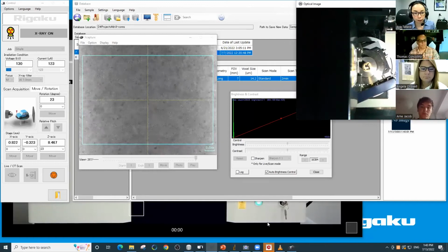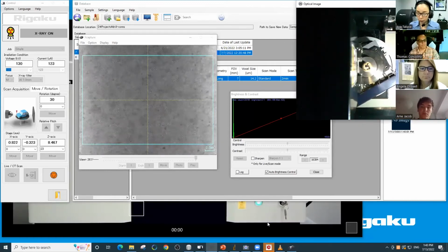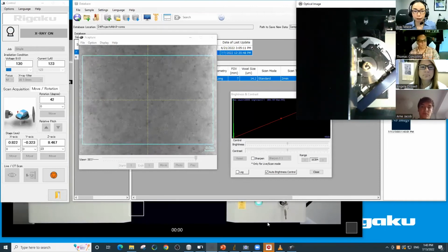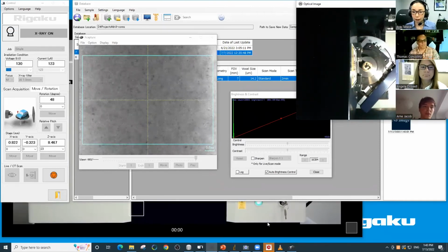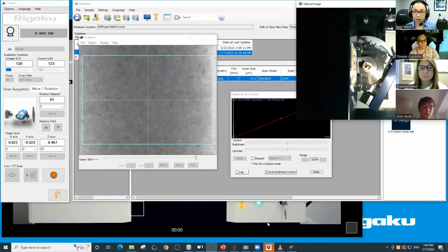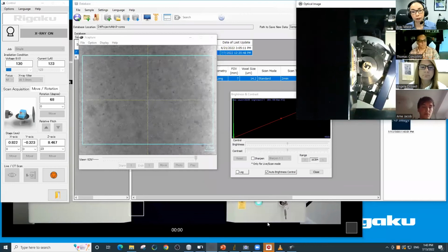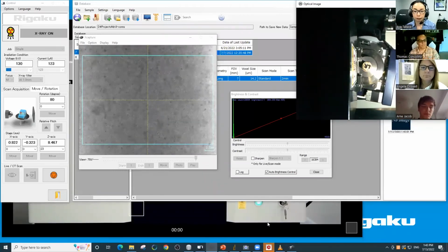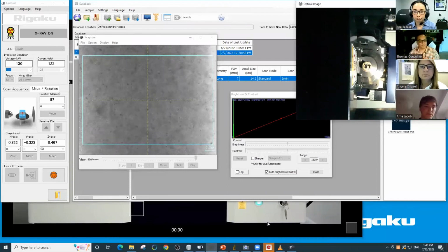Okay, so I've got one for Arn because he raised his hand and told me that he wants to answer this one regarding a 2 petabyte data set. It's kind of what can be used in order to adjust your system for that. I'll let him address that because I saw him wanting to answer that one directly. So if you want to chime in, Arn.